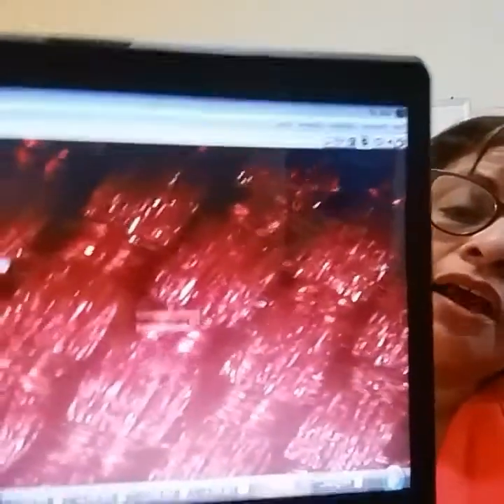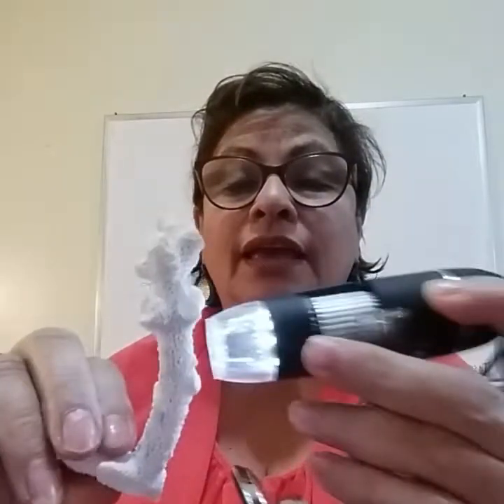I already have one set up on my laptop, and as you can see — believe it or not — that is my tablecloth. You can see the individual fibers in the tablecloth. It looks much better on the laptop than it will on this video, which is why I want to add pictures toward the end. I also had the camera on top of some coral and it took some really good pictures.